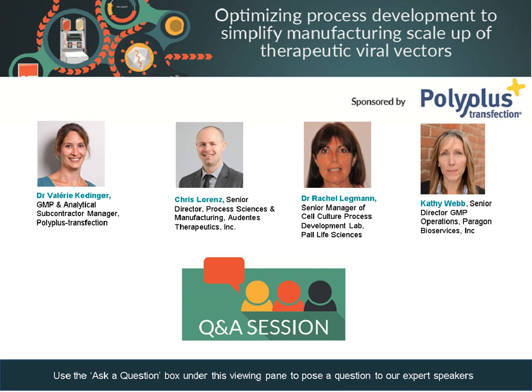We have worked with clients before who might have been in an adherent system, and once we've worked and provided some data, you can look at some comparisons in suspension and see if it's a viable process. But anytime you make a change, it will add some additional time to your development. Yeah, of course. Thank you. And then, Rachel, you sort of touched upon some of the pros and cons around adherent versus suspension in question one. I wondered if you could elaborate upon your thoughts there.